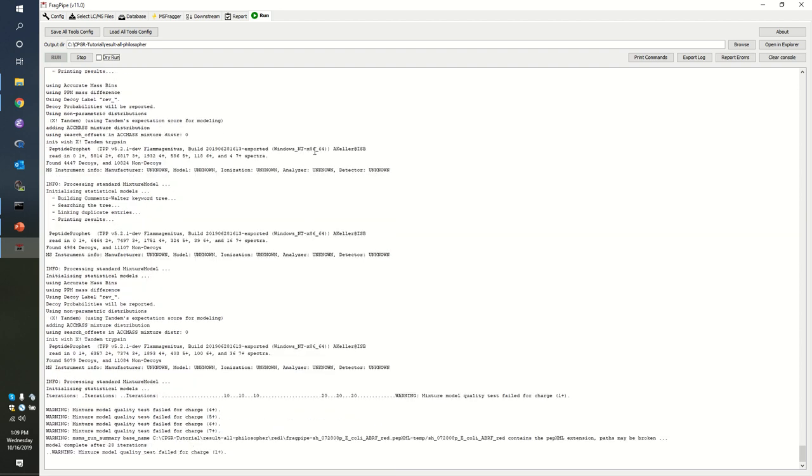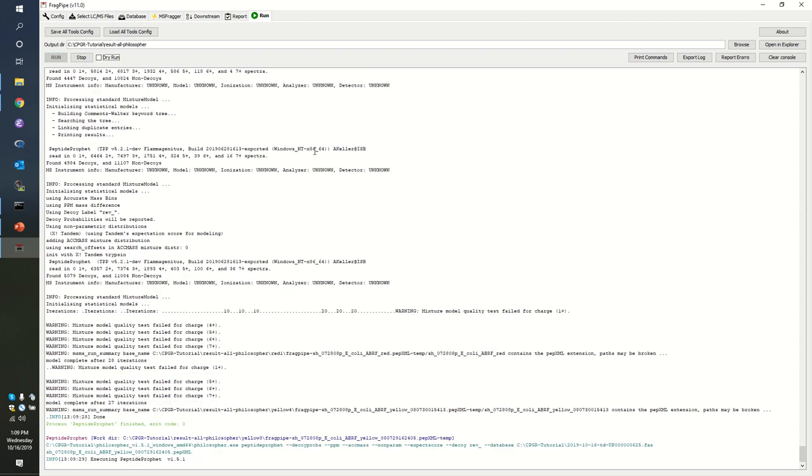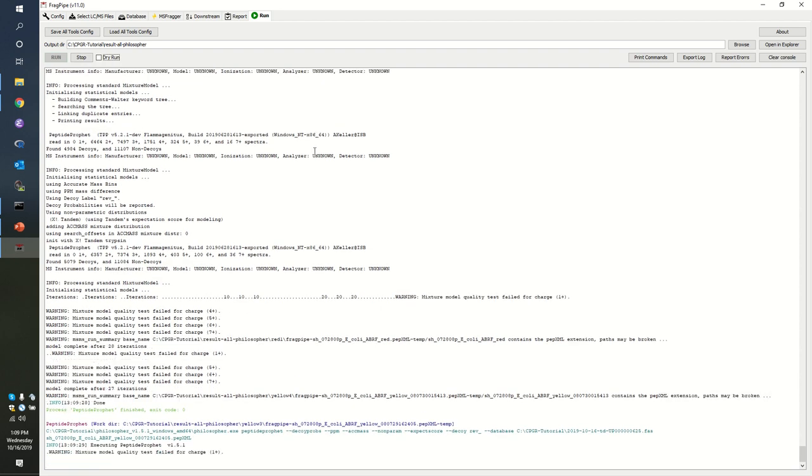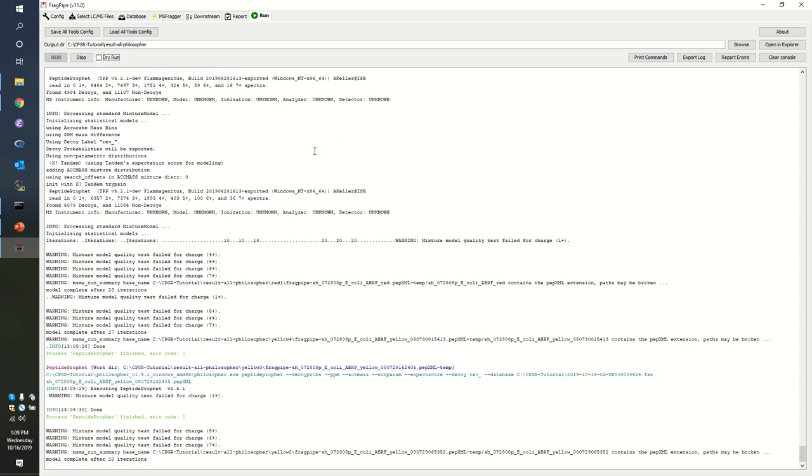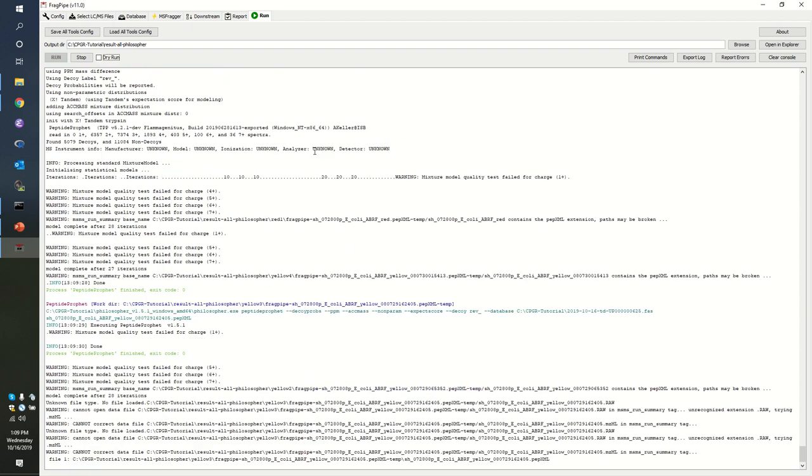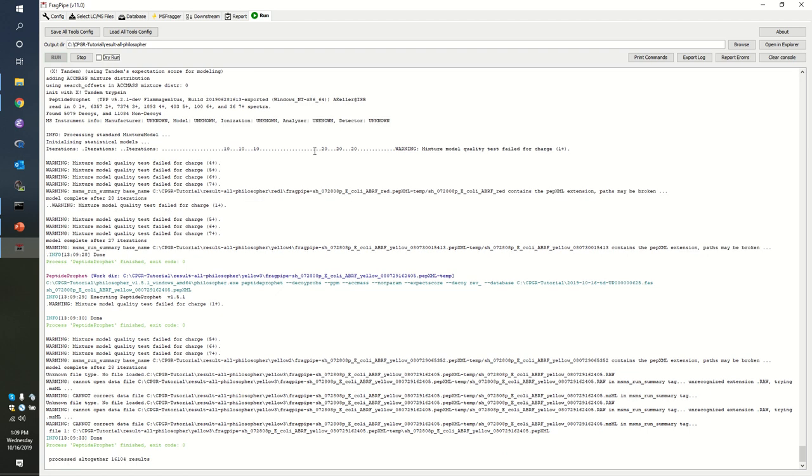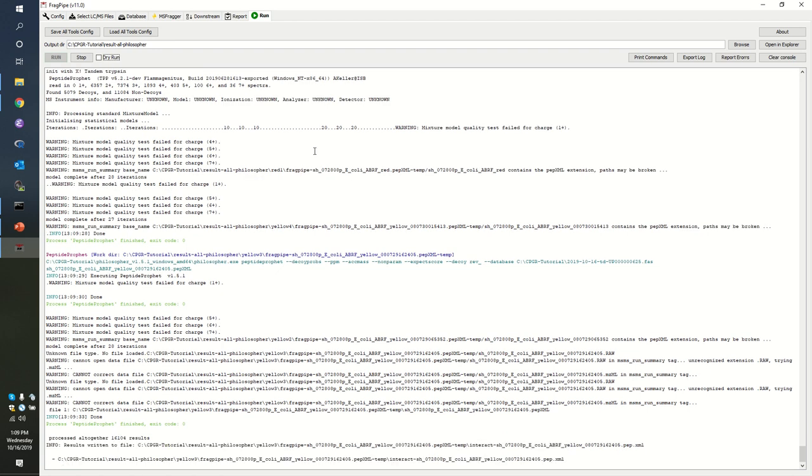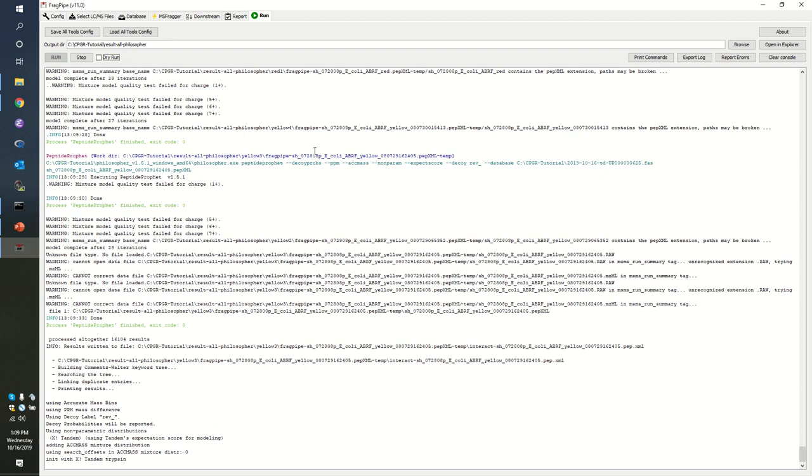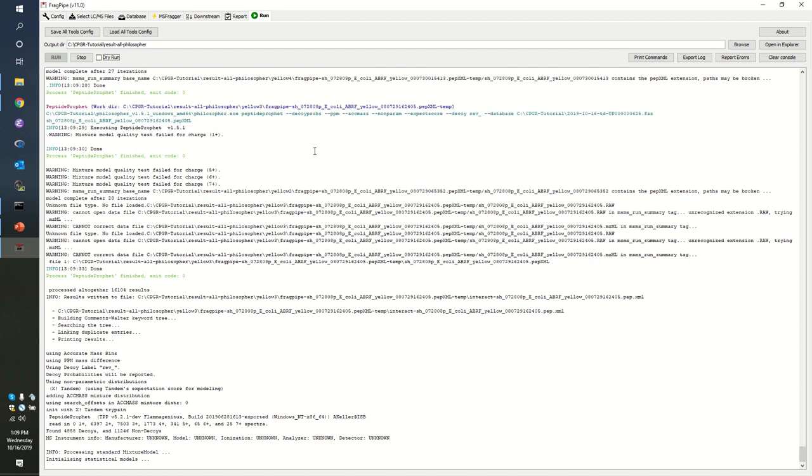I want to point out that in the background, we can see that the software is evaluating these PSMs, digging out of the pepXML file. You'll see that we're getting some warnings back that say, mixed model quality test fail for charge five and six, or five, six and seven. I want to try to explain what that means. The software is attempting to put probabilities of correctness on individual PSMs.